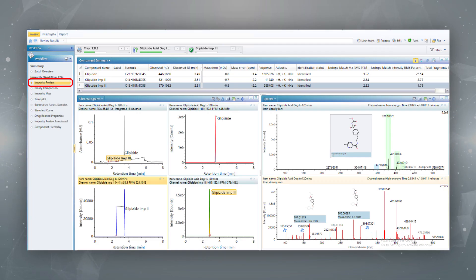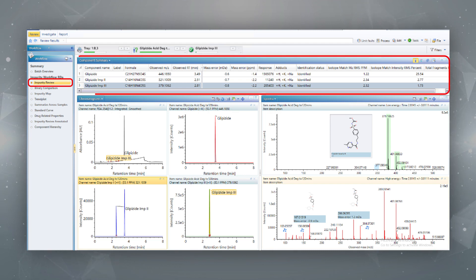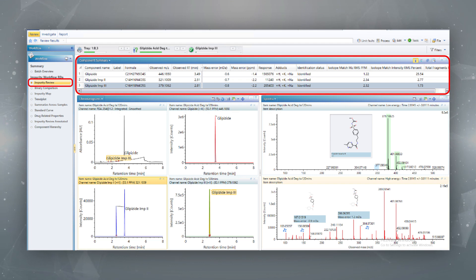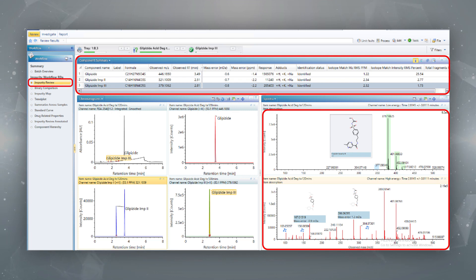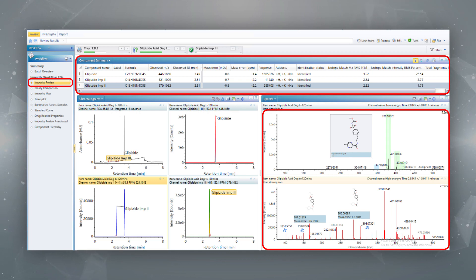Now let's take a deeper dive into the data. We have selected the workflow step entitled impurity review. This time we have chosen the sample incubated under acidic conditions for 120 minutes at 80 degrees C. The component summary table is highlighted, which shows that UniFi has identified the glipizide parent compound along with impurities 2 and 3, with the latter selected. On the right hand side of the screen we have the low energy channel at the top showing the mass spectra and structure for impurity 3, and on the bottom we see the high energy channel acquired simultaneously showing the fragments generated from this degradant. The structures are automatically visualized with the charge-retaining portion highlighted.